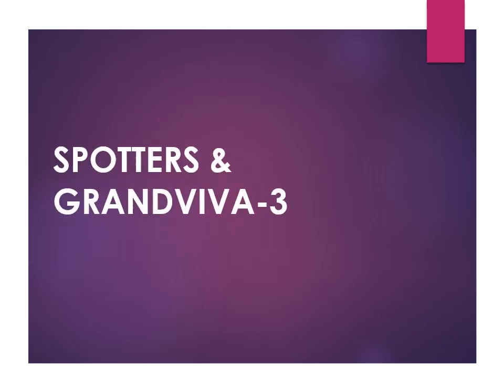Good morning, everyone. So, I have already made two videos on the spotters and the grand viva, and it is the continuation of that series only. And I am trying to include more and more spotters in this video so that it will be very helpful in your microbiology practical exam. So, let's start without wasting time.